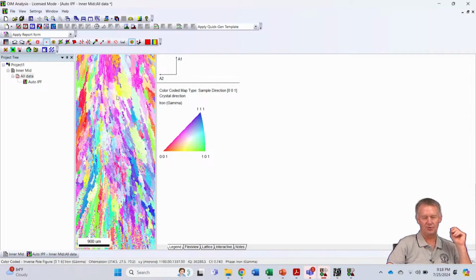So this is the growth direction vertically. Stainless steel, the low carbon steel's on the outside. We don't see that here. So we see a predominant growth direction, right? Now actually this is upside down from where it actually grew. So we had low carbon steel here around the donut and then filled it in with this stainless.